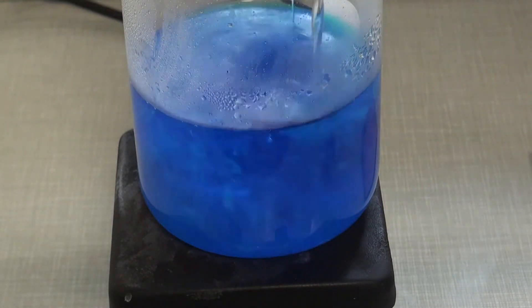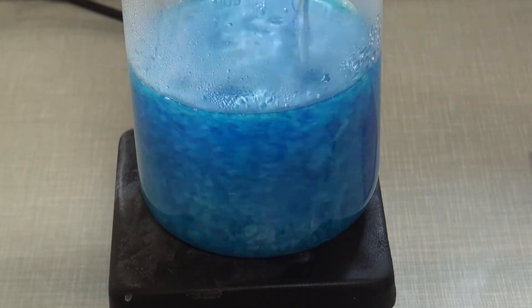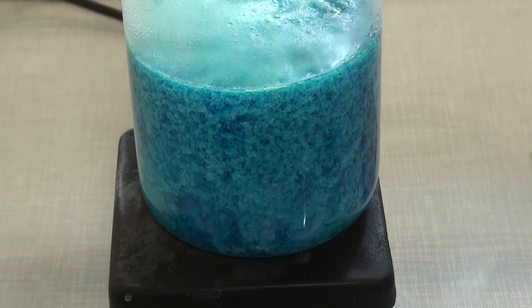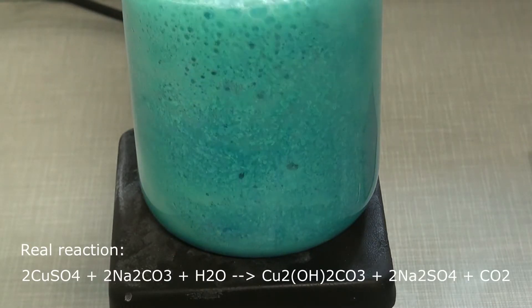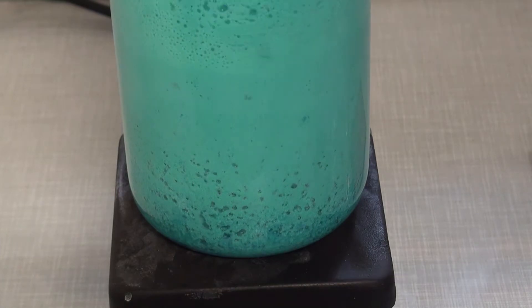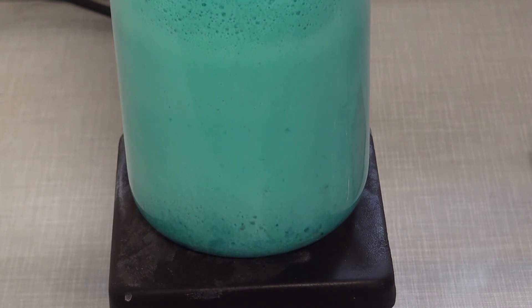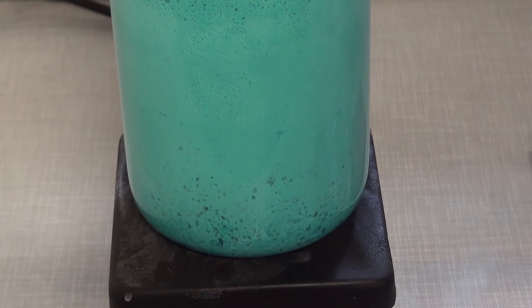Immediately there was a blue precipitate falling out. Theoretically this would be copper carbonate, but copper carbonate is extremely water-sensitive and reacts to form basic copper carbonate and carbon dioxide. Basic copper carbonate contains both hydroxide and carbonate. This should not be a problem.